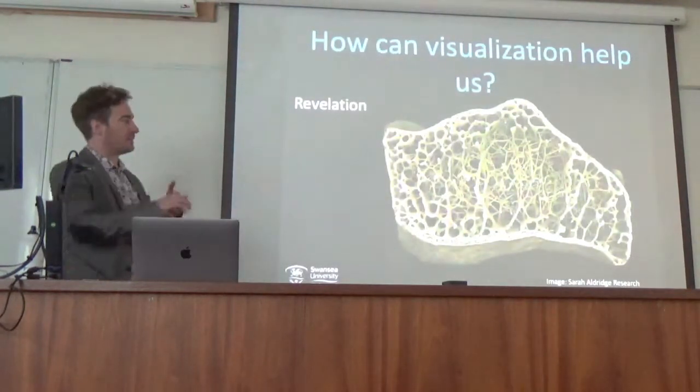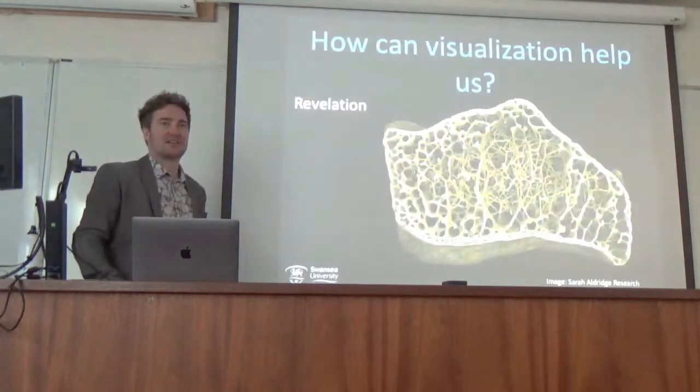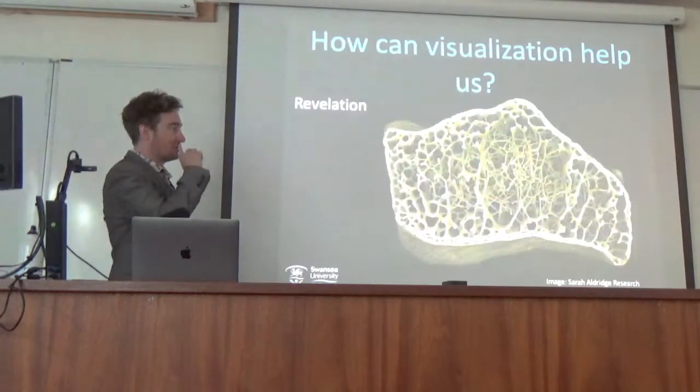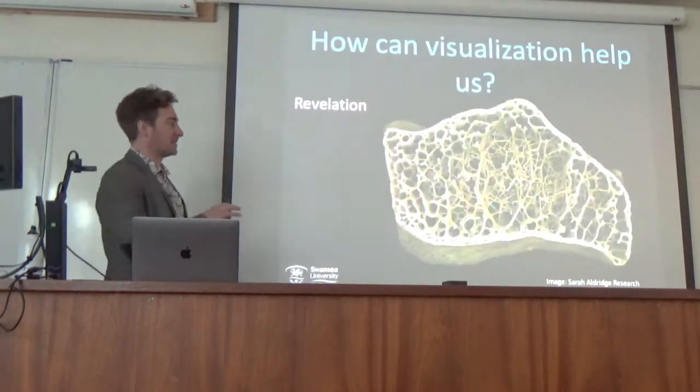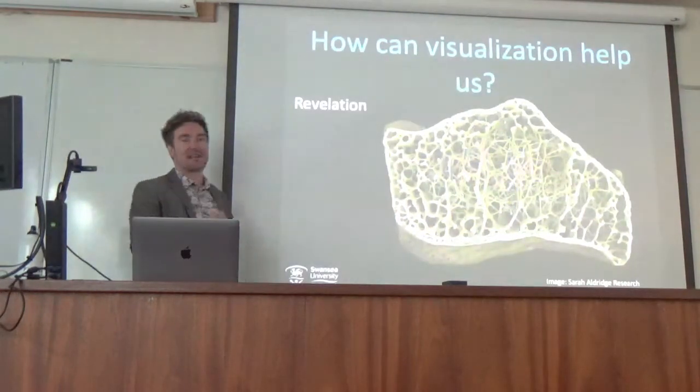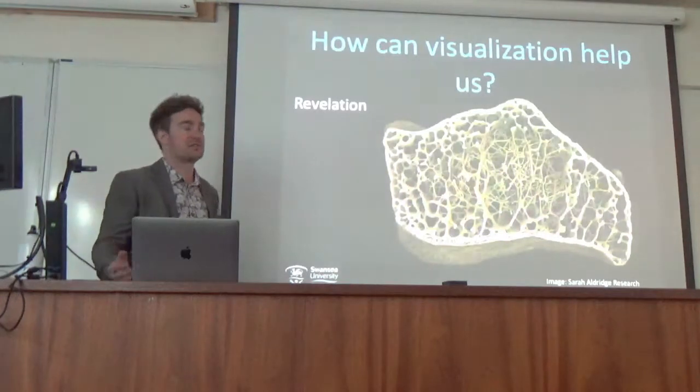You get lost in that trabeculae. I need a picture of this on my wall because I see a different thing every time I look at it, and it's the visualization that does that. It's no different from any other data we've generated in the lab, but it's this particular visualization. The time Sarah spent to get this visualization was definitely worth it, because it created interest in her research.